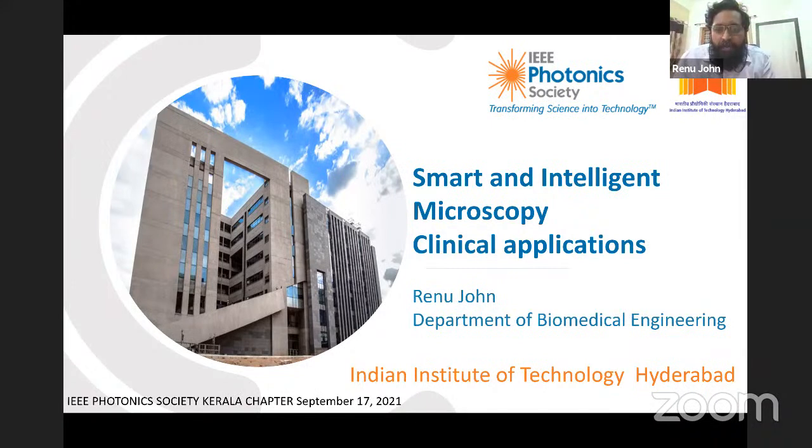So today's talk, I will be talking a little bit more about optical microscopy, then a little bit in detail about how we image in 3 dimensions or depth, and the phase of the images, especially related to biological cells and live cells. And then I will wrap up with the recent developments of how we use AI and machine learning applications in microscopy for various diagnostic applications.